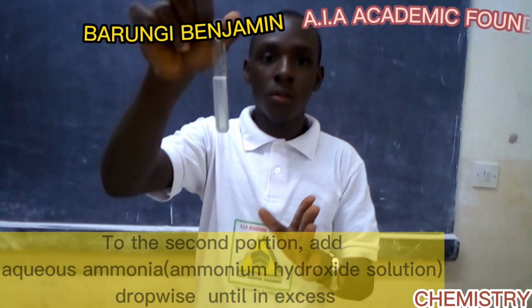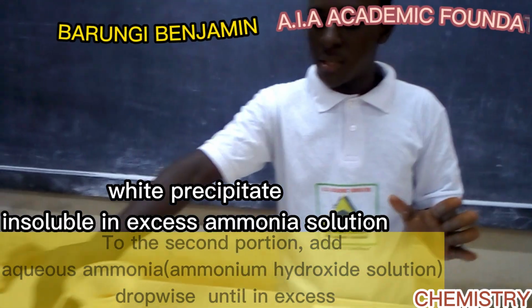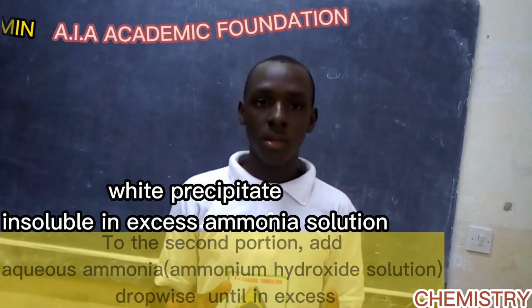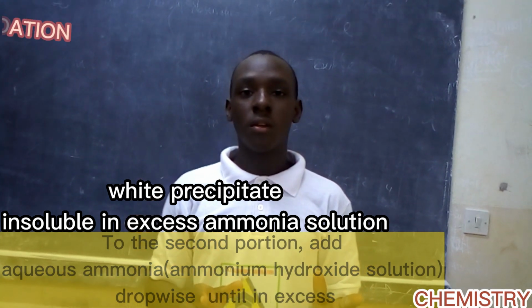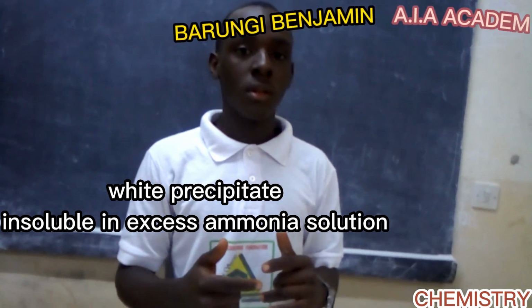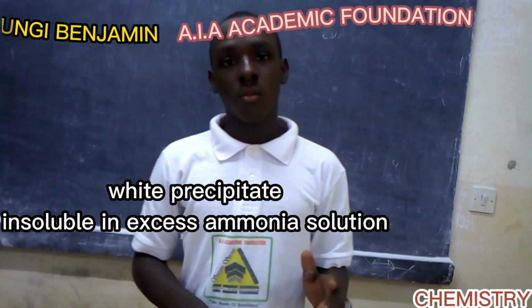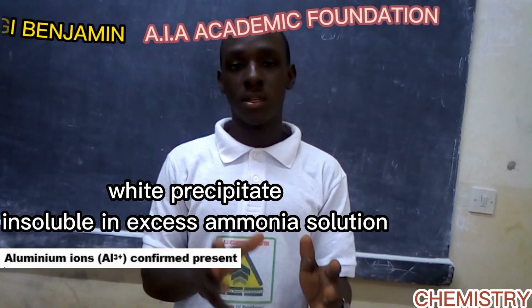As it failed to dissolve, we know very well from our first results that zinc 2 ions, aluminium 3 ions, and lead 2 ions form a precipitate with sodium hydroxide, which is soluble in excess. But now, with aqueous ammonia, we have formed a precipitate that is insoluble in excess.